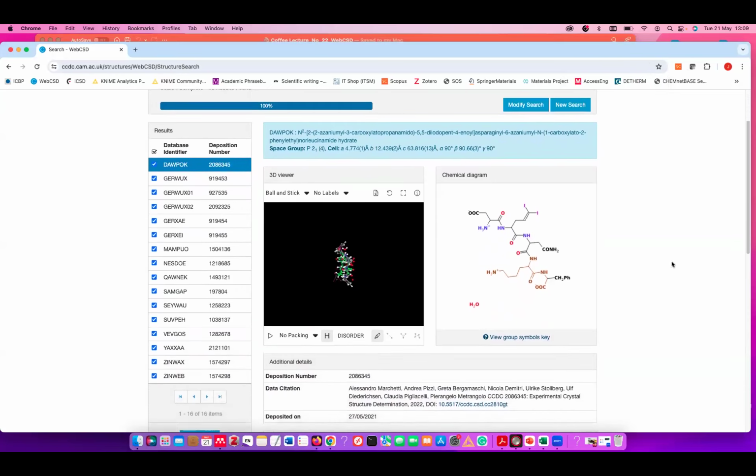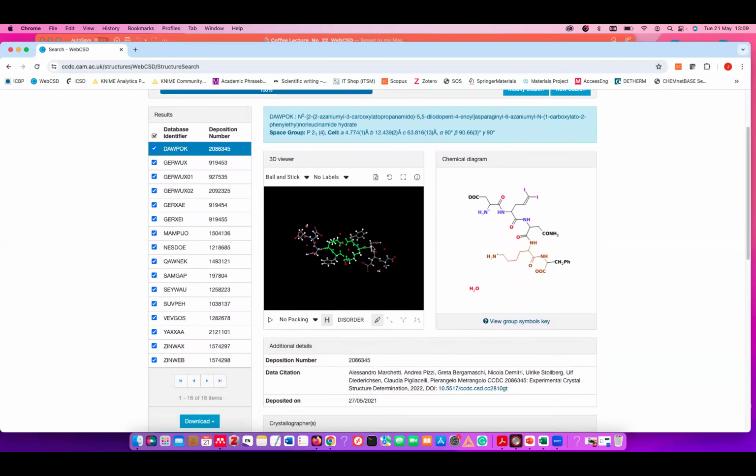And what you can see now, since this is already a little bit more complicated, is that actually only this brown part on the right-hand side or the green part on the left-hand side is the fragment that I drew, and everything else has been added because of the substructure search. Yeah, this is basically what happened here. An exact search is no longer available in WebCSD. That was available with the old sketcher, but now no longer. And then again, you can explore this.